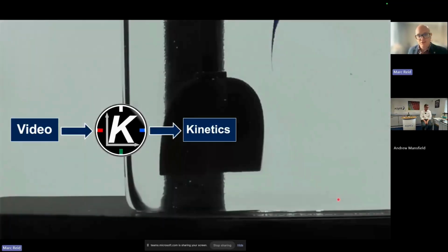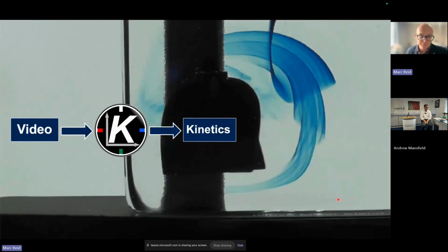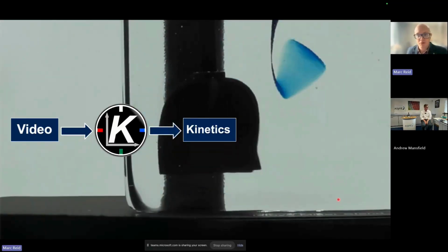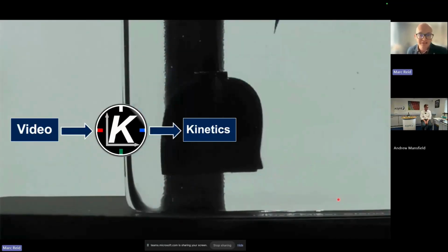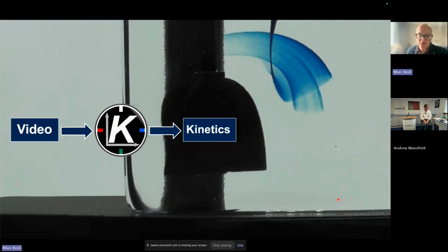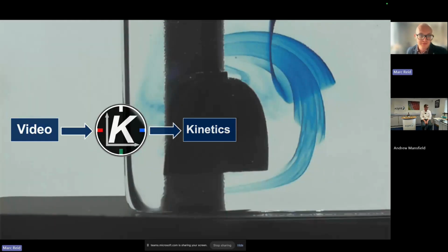To take this closer to how we came to collaborate with Asynt more recently, I'll share a little bit of a study that we published recently in ACS Sustainable Chemistry and Engineering, where we asked, how can we quantify mixing in highly viscous solvents, and what is the impact of switching to a highly viscous solvent on the organic synthesis that we want to achieve in those sustainable solvents?